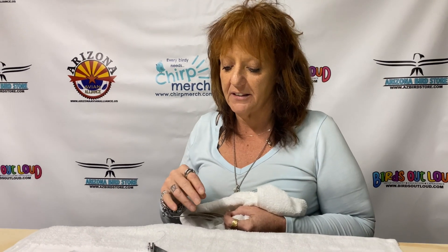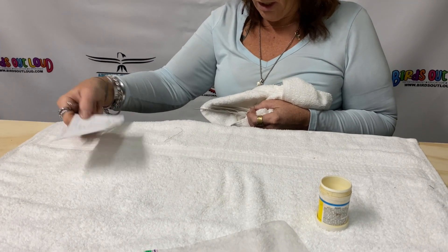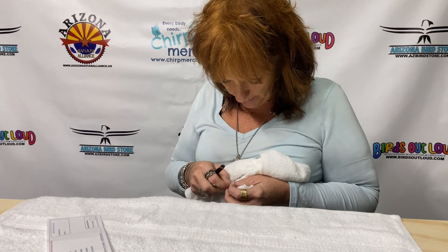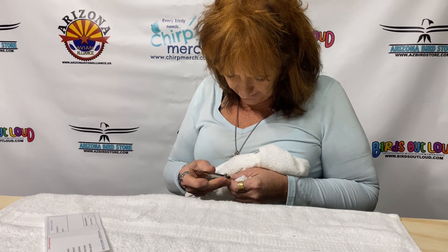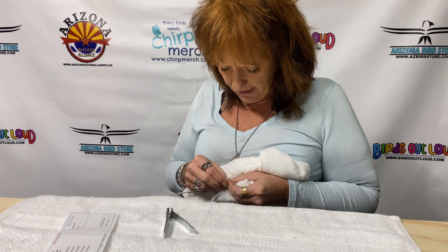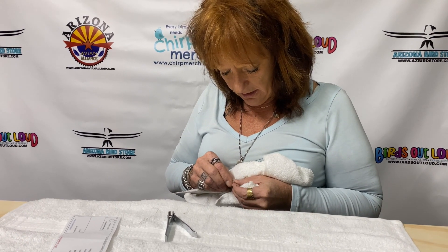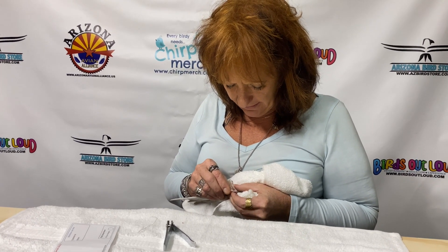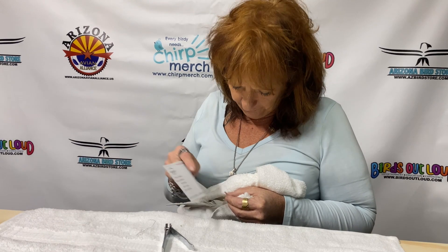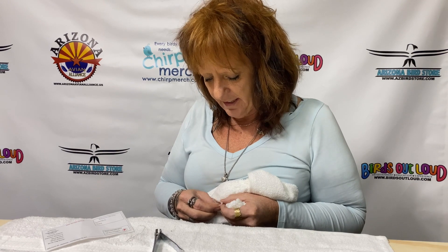I have things ready — I have my clotting material ready, my paperwork ready to go — because we want to make this as quick and painless as possible. So I'm just going to clip this toenail just a little short. Sometimes I have to work the blood out. I need about three drops of blood to send off.